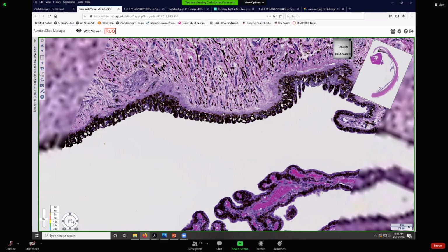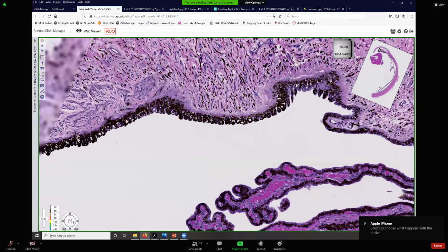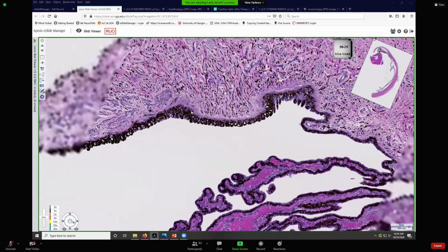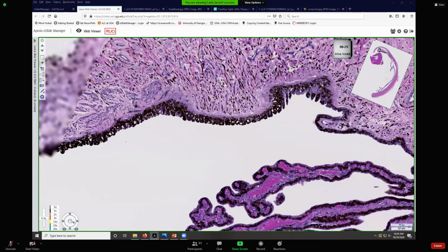And that anterior layer, which was the outer layer on the ciliary process, becomes modified and has contractile fibers in it. So this myoepithelium, an epithelium with contractile fibers in it, is the dilator muscle, the dilator pupillary muscle. We'll zoom out.